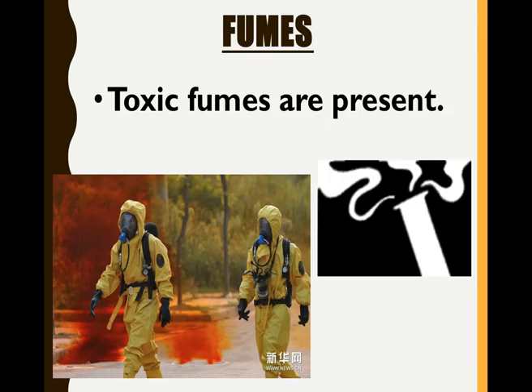Take a look at this next symbol. Mark down what you think it might mean. Let's talk about what it actually means. It means there are toxic fumes present. This means this is something you would not want to inhale. This is something that could be dangerous if it gets inhaled into the respiratory system.